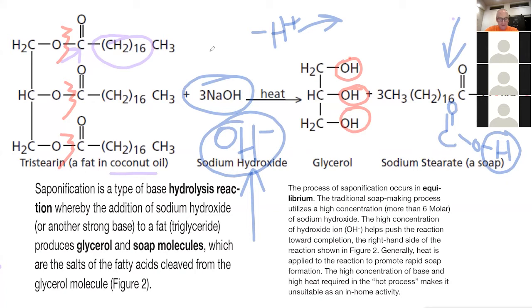It becomes neutral, right? What becomes neutral? The pH. I mean, no, actually the pH will be very high. In the presence of sodium hydroxide, the pH will be very high. And what happens to acids in the presence of sodium hydroxide?